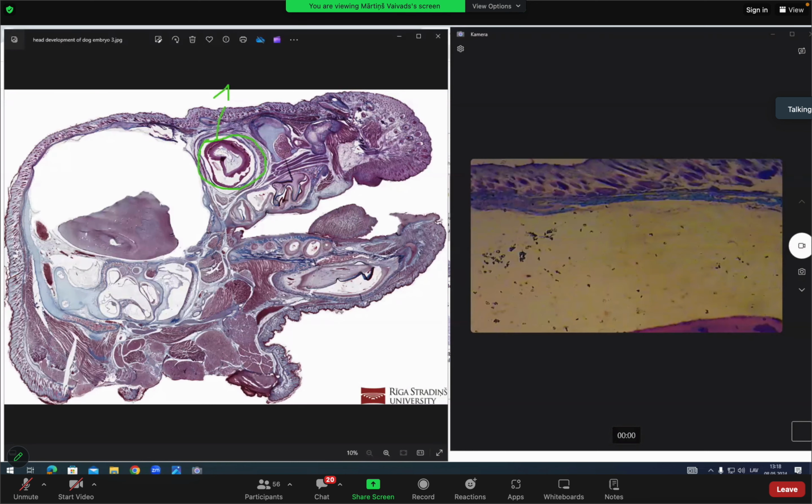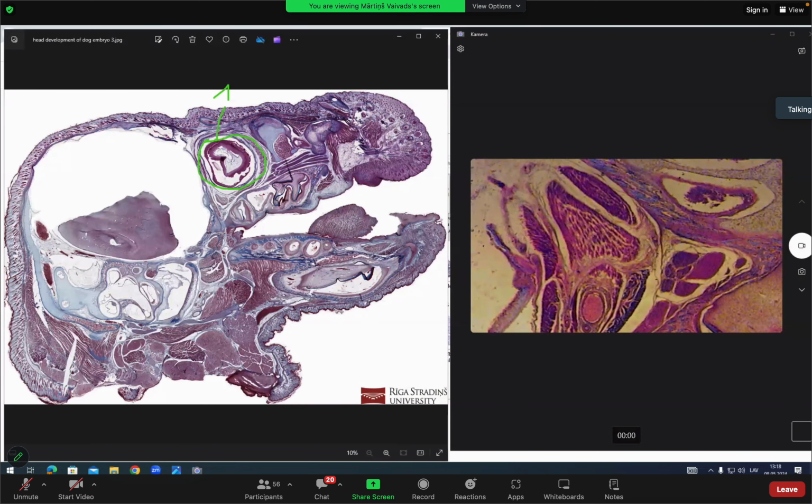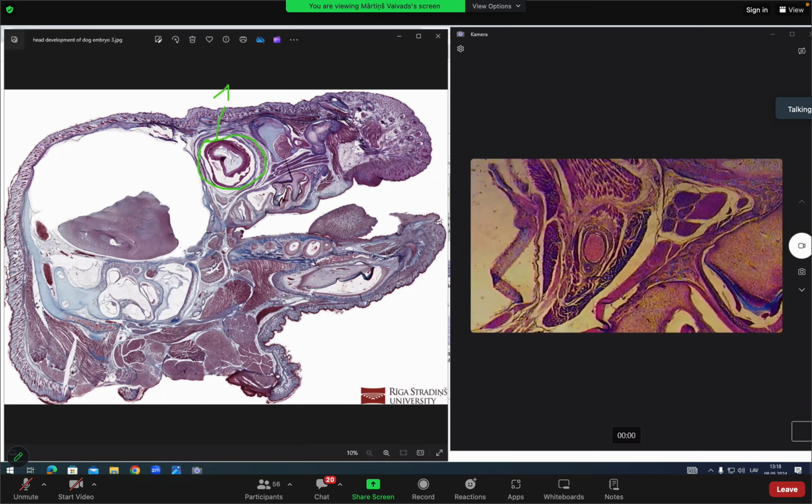In this dog's head, actually, the eye is not present at all. There's only a small fragment from the optic nerve. So, in different dogs' head slides, there can be variations. Here, the eye development is super small. You only see the optic nerve, but on the slide picture in your e-studies, you see something bigger. Interestingly, here with number 2 in the picture, only in the picture, but not in the slide, neural retina. There's no lens here, only neural retina. That's special here for this slide.